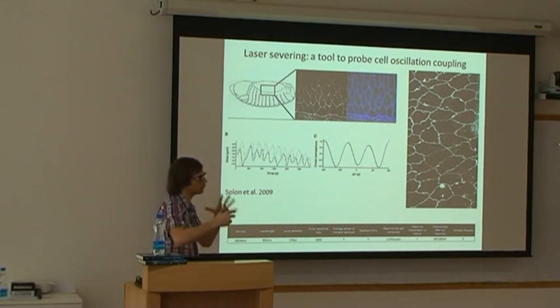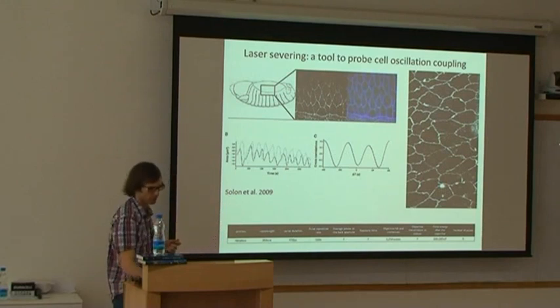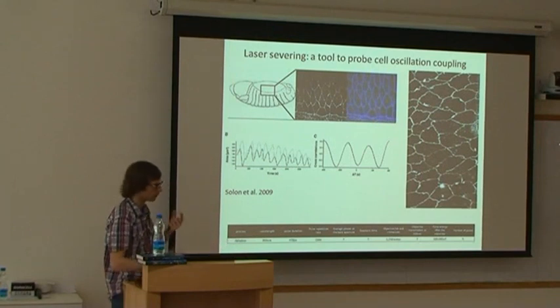This will make it grow if you continue to send pulses. The pulse duration, and also the repetition rate of the laser, and how much you expose the sample will determine the life of the plasma.